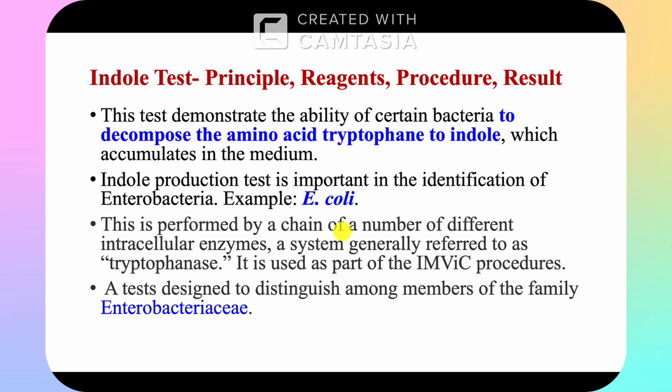So what about the other test, which is the indole test?